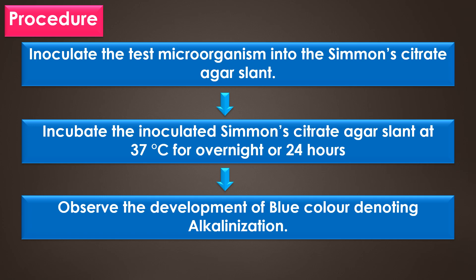And finally, observe the development of blue color denoting the alkalization in the Simmons citrate agar slant.